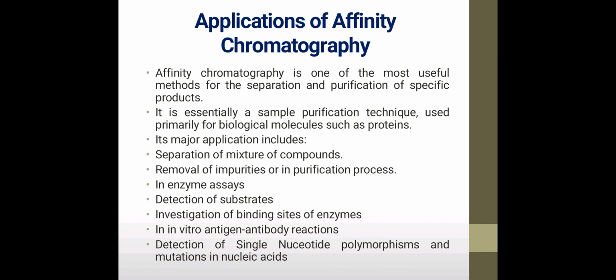And now let's see the applications of affinity chromatography. So what are the major applications of this affinity chromatography? Affinity chromatography is one of the most useful methods for the separation and purification of specific products. So many biological products can be separated using this technique.